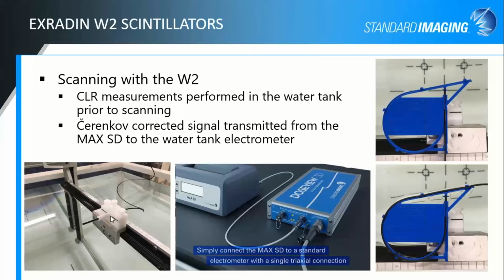So it's really just this acrylic sleeve, has a wider end and a narrower end. There's a thumb screw, I think you can see a little bit here. There's a thumb screw on it that you would gently clamp down on the fiber. The end of the fiber has a Kapton tube around the outside of it, so it's a little bit stiffer just at the end. And then you can clamp down on this acrylic adapter without worrying about either crushing your fiber or having to clamp down on a really, really tiny fiber in a holder that's meant for a bigger chamber. It also allows you to get the tip of the fiber out away from the scanning apparatus, so there's no concern about the side scatter or back scatter from any of that as well.